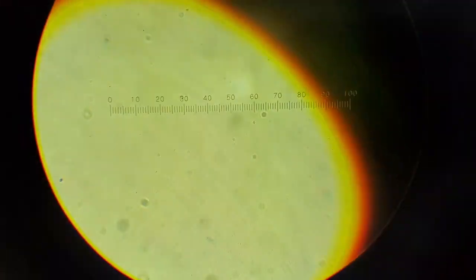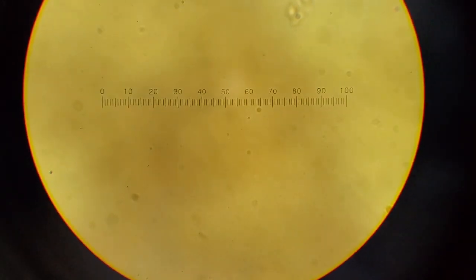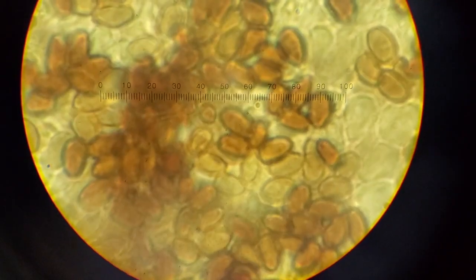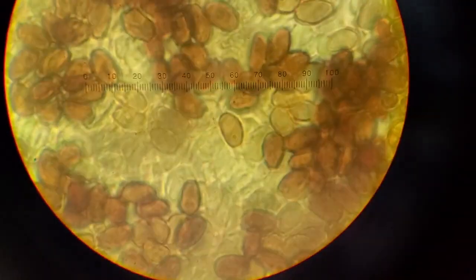Oh, that's probably why. Let's go this way. Maybe it's here. Okay, I think this should be good. So what I didn't want was to measure spores that were directly on the surface, still attached, almost seemingly, to the basidia.